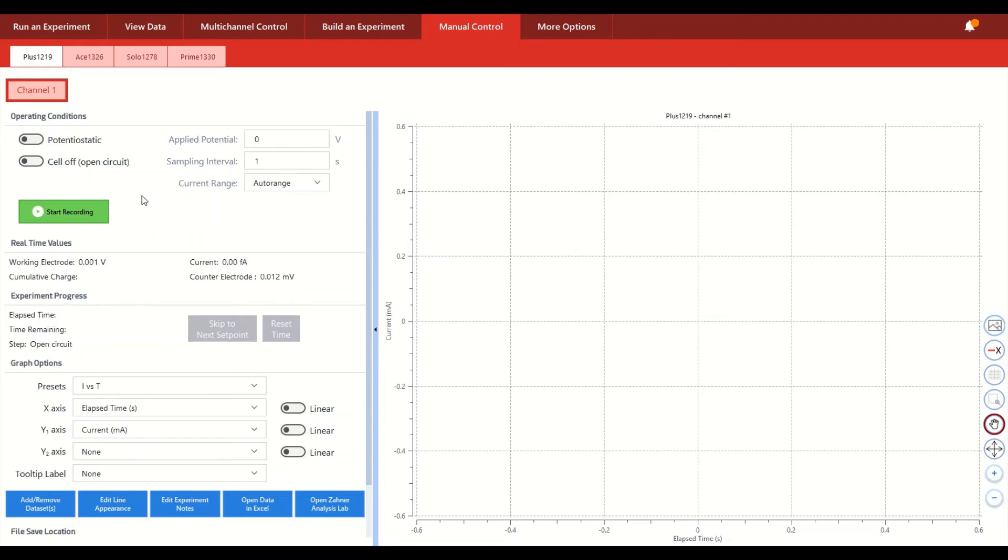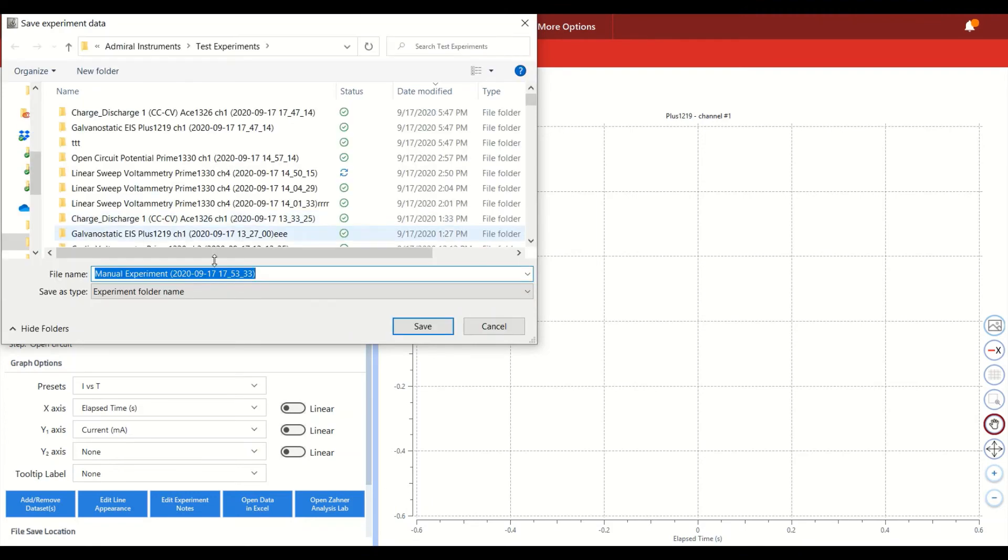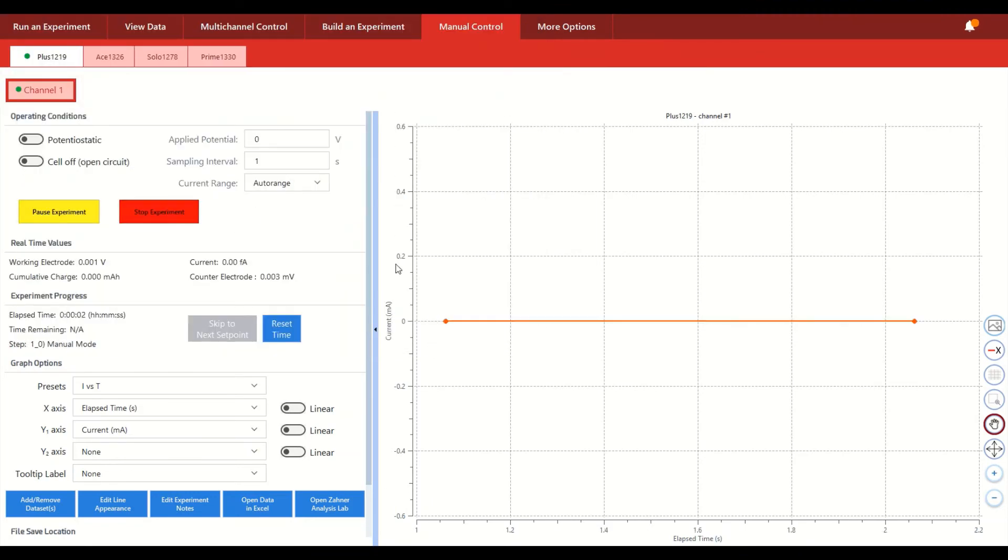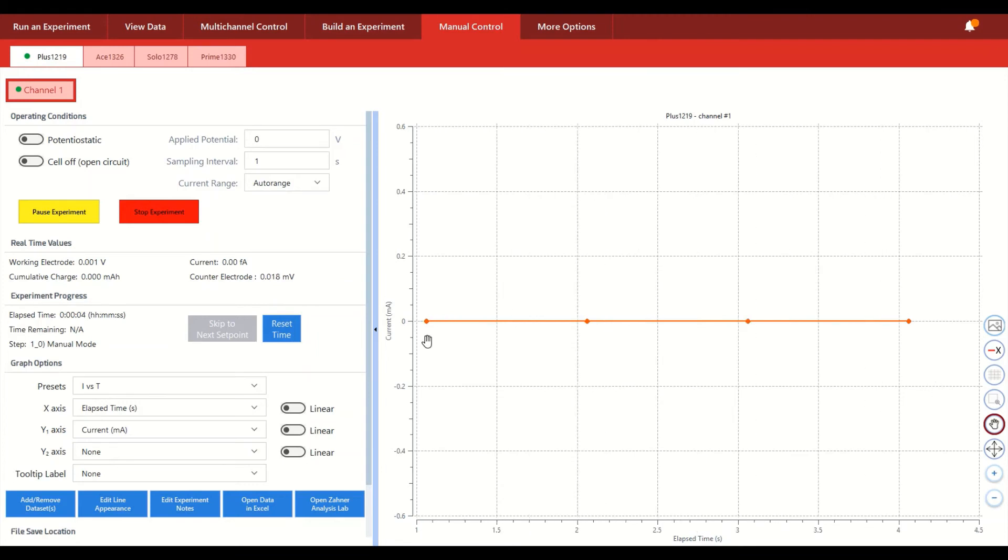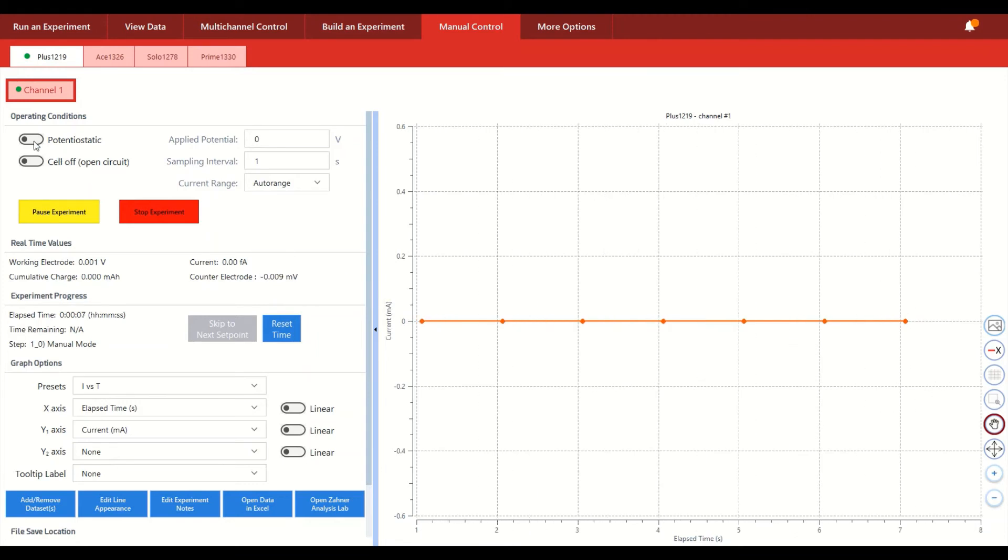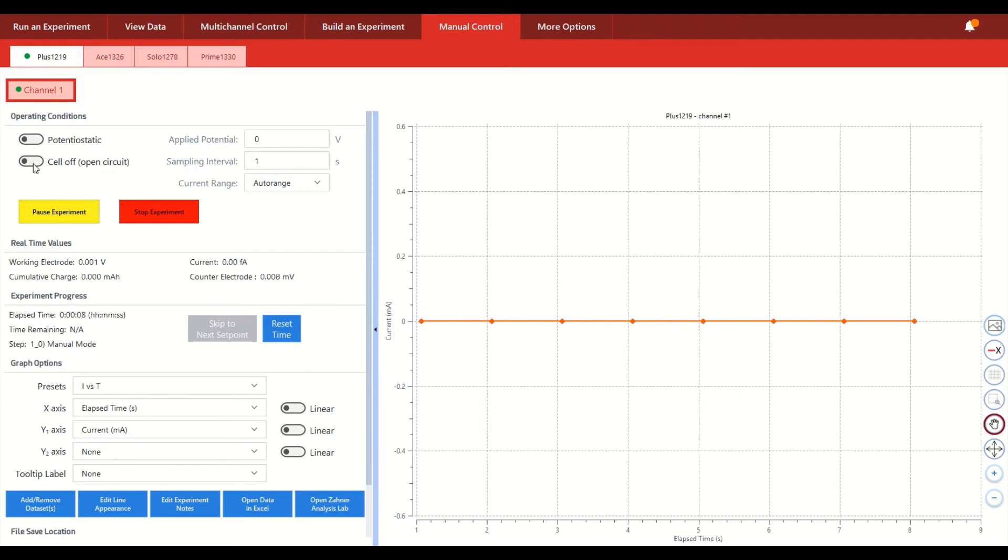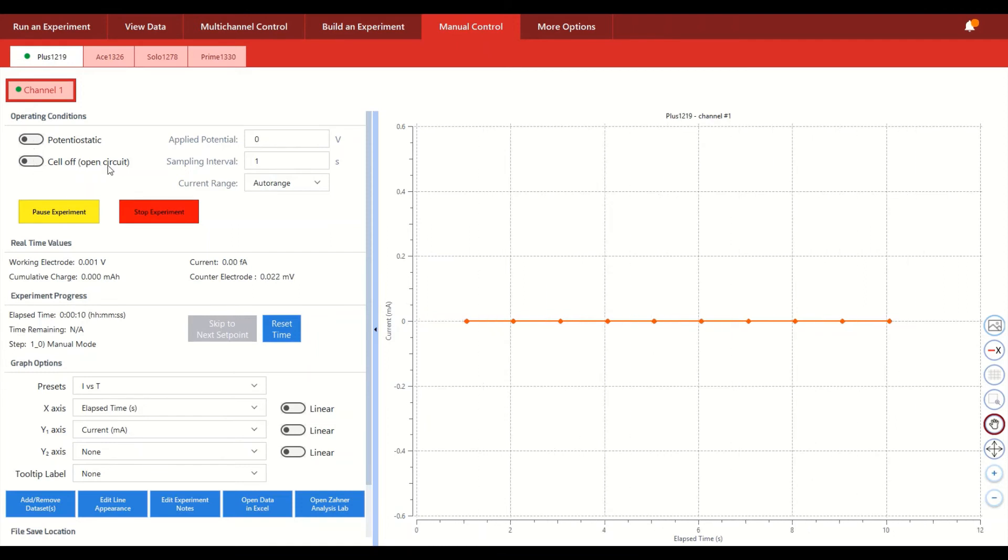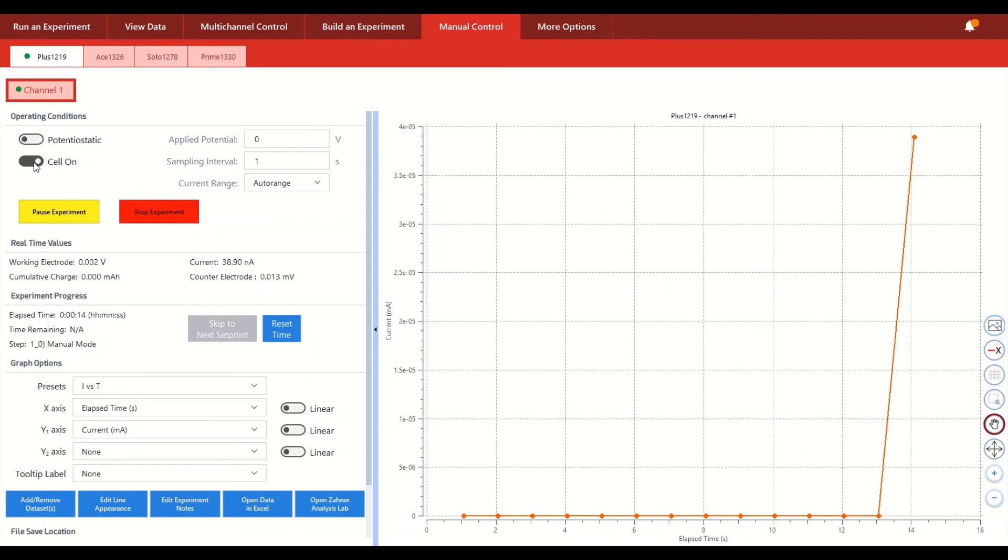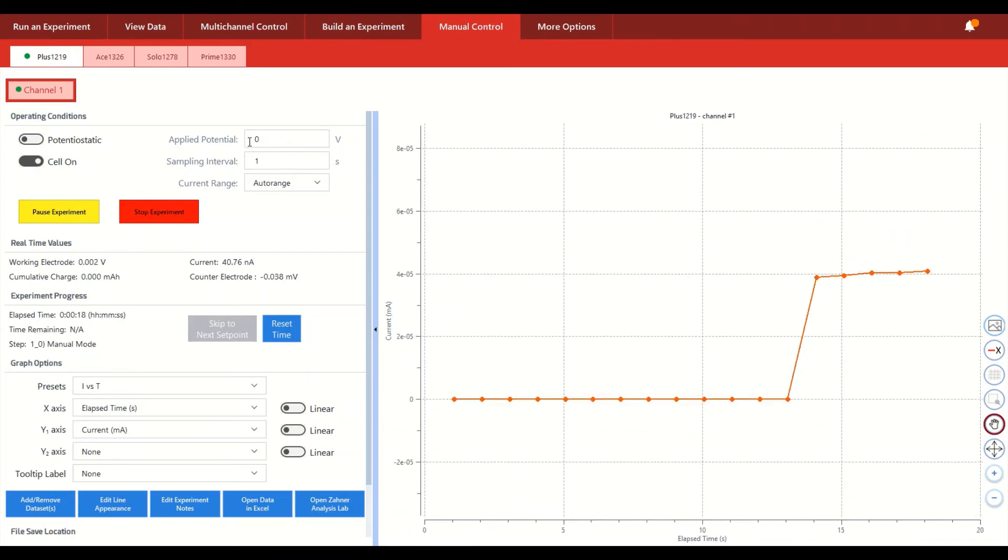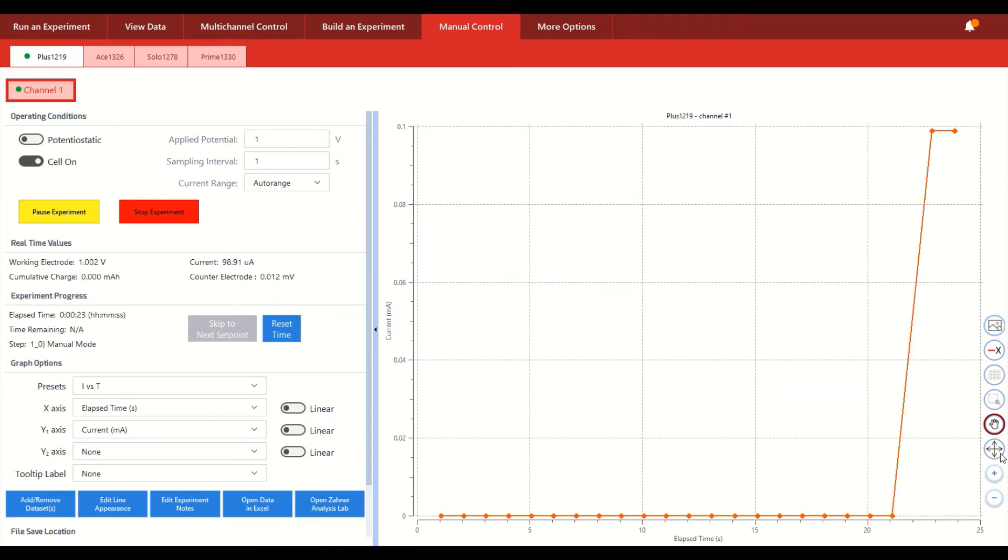But the main difference is that we can start recording data on this channel and data points will just begin to be charted. And then we have the ability to either be in this open circuit mode or change to actually activating the channel itself at whatever applied potential, which in this case let's change that to one volt, for example, just change it in real time.